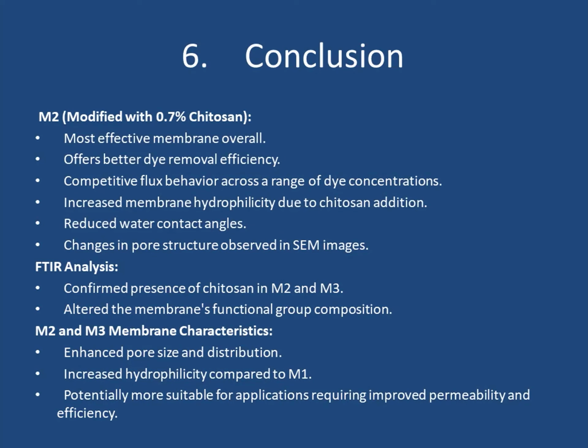So the FTIR and the membrane characterization had proved that for M1, M2 and M3 we have the same base material, but for M2 and M3 only, Chitosan has been added.